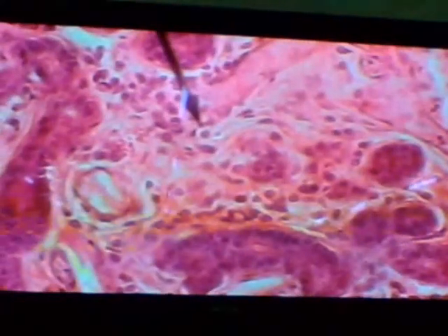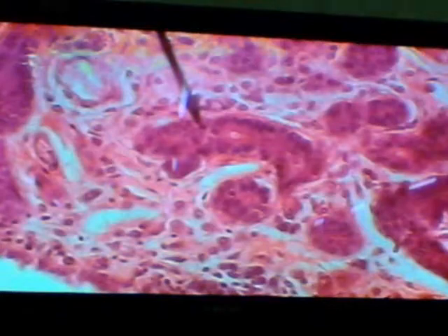Okay, let's come up a little higher. Right, and there you see them. These are the glands of Wolfring. Good. And then as you come towards the epithelium here, the epithelium has two kinds of cells.